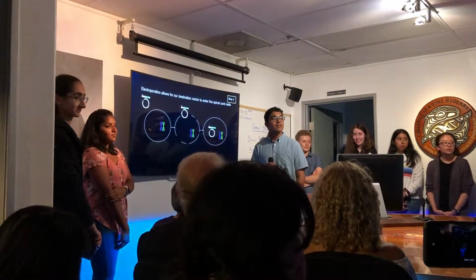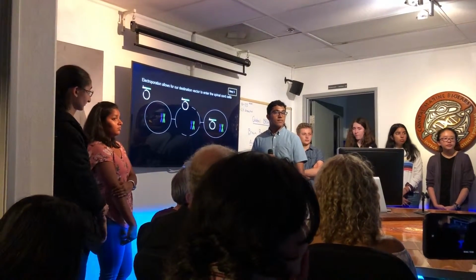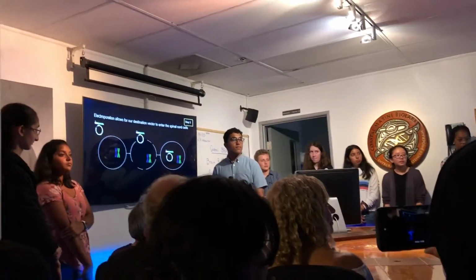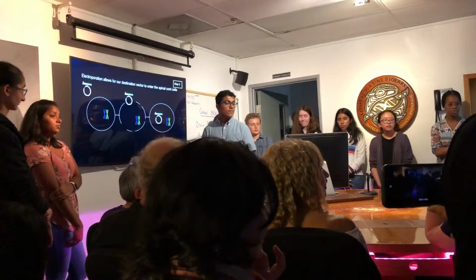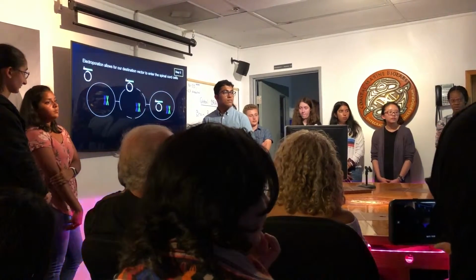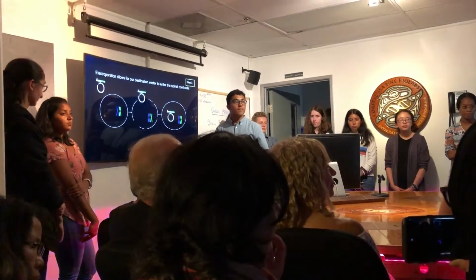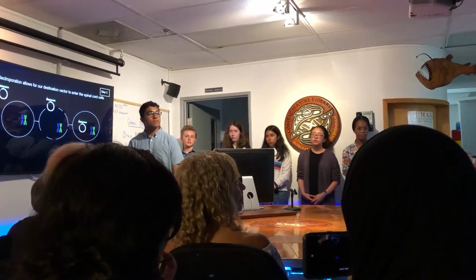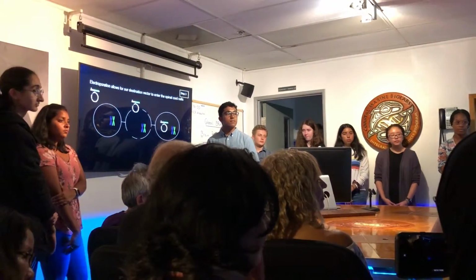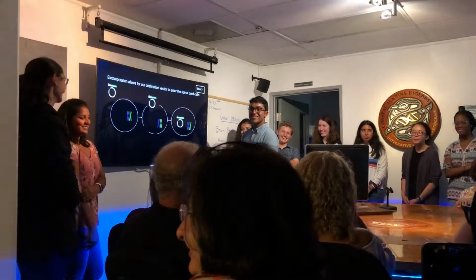No, it is not, and it doesn't need to be, because we're just looking at transient expression, or the possibility for transient expression. This is a neat little trick that is a function of the system, and is part of the reason why we chose the chick model system for these experiments, because they can be done quick, dirty, fast, and you can look at transient expression. There are other techniques, not in the chick, in other model organisms, where an introduced foreign DNA will get integrated into the host organism's chromosomal DNA. We don't have to do that here. We don't maintain colonies of chickens, though, do we? No, we don't.